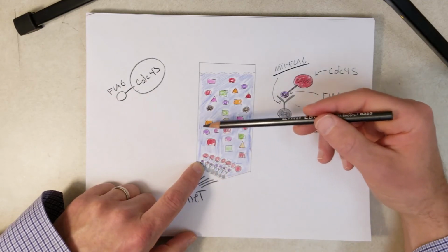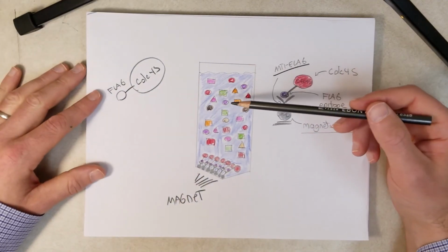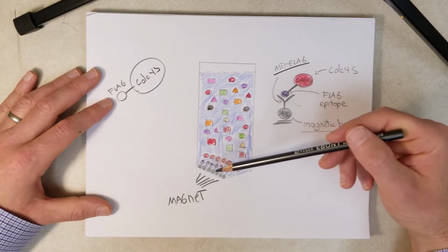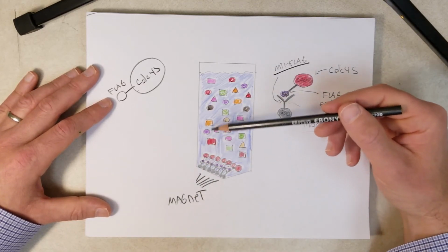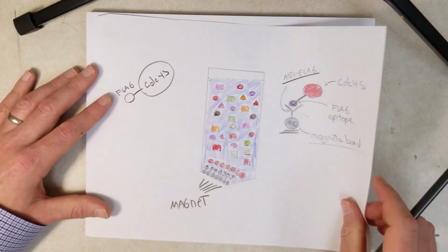And then we have all the tens of thousands of other proteins. Well, if this is yeast, it's going to be what, 6,000, unless, you know, splice variants too, so maybe more. But let's say 5 to 10,000 different proteins in here, and they're just floating in the solution. They're not interacting with the magnetic beads or the antibodies down here, or the flag antibody down here. And so what we can do now is just remove all this liquid, then add some fresh buffer.